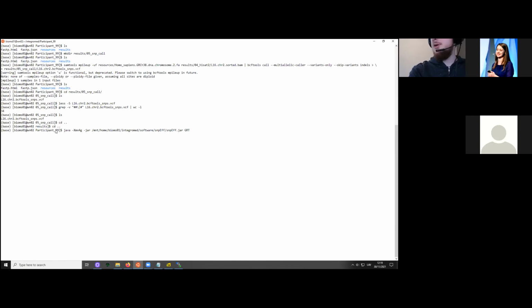Now we specify the database version that we're going to be using. The assembly is basically the latest version, 38, but the 99th is not the latest subversion; it was the latest subversion which was available for this software at this time.